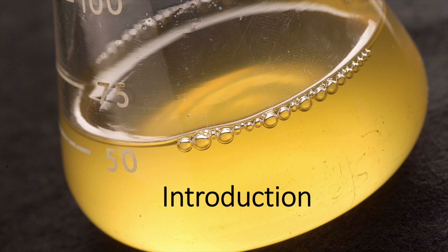This experiment aims to understand the batch kinetics of cell cultures. Two nutrient media, LB and M9, and two reactors, benchtop shaker and bioreactor, are used. Kinetic parameters are determined and compared for each operating condition.